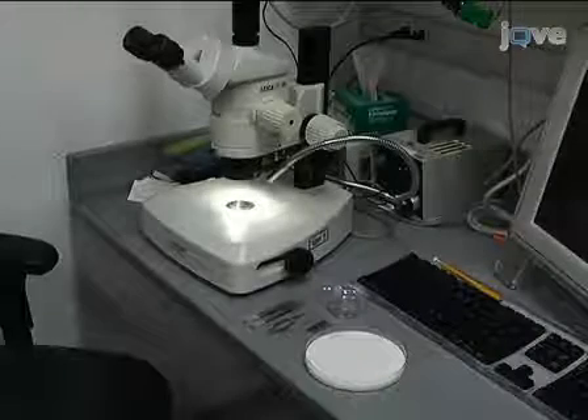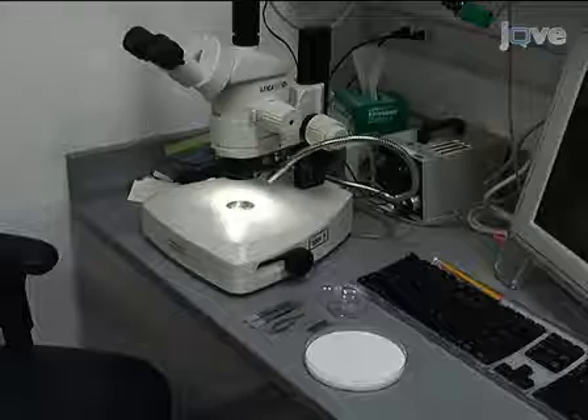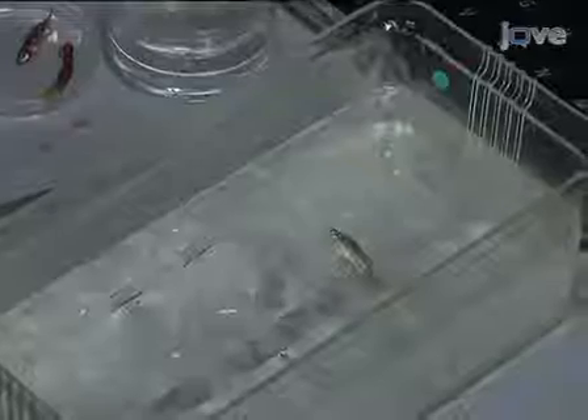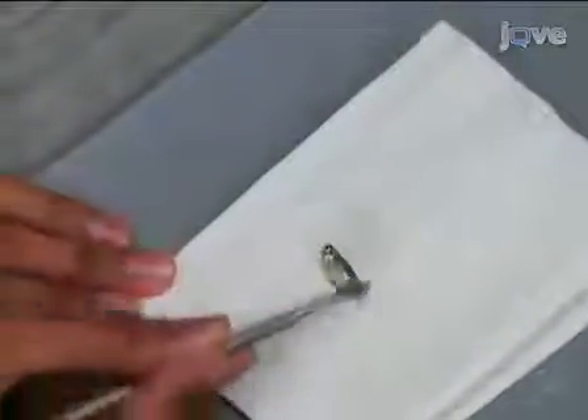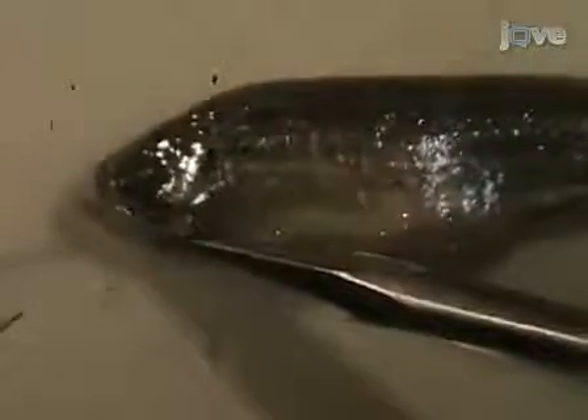For the dissection of a female fish, you will need the same tools as before, with the addition of some fine needles, a razor blade, and a dish of Ringer solution for the heart dissection. Pat the euthanized fish dry and pin it to the dissecting mat as before. Use the same techniques as before to remove the skin from the side of the female fish.